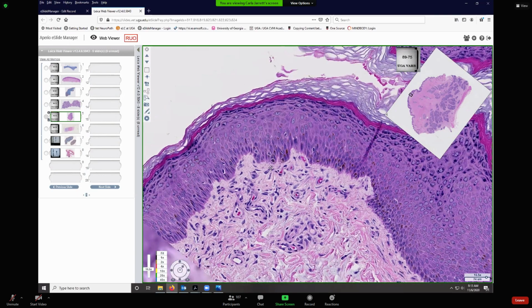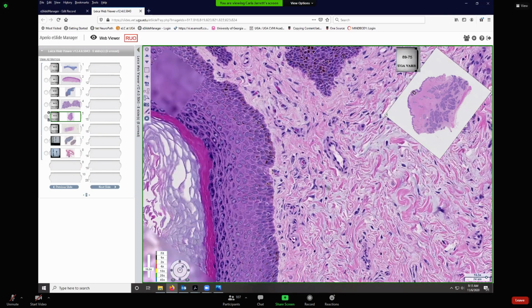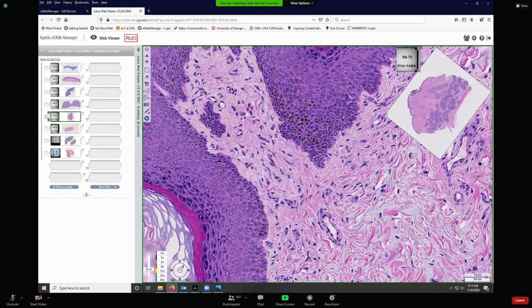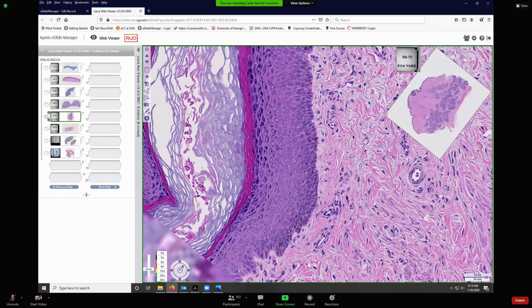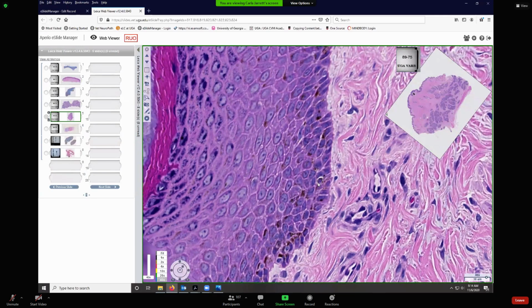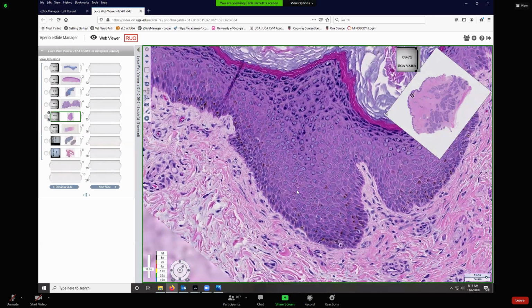It will look, let's see if I can find an oblique area. It'll look several layers thick, like right here. Okay, because you can see all the little melanocytes in here. And so this looks like a stratified stratum basale, but that's just obliquing. Okay, so it's really just a single layer thick, like what you can see right in this area right here. That's a little blurry right there. Okay, so single layer of stem cells.